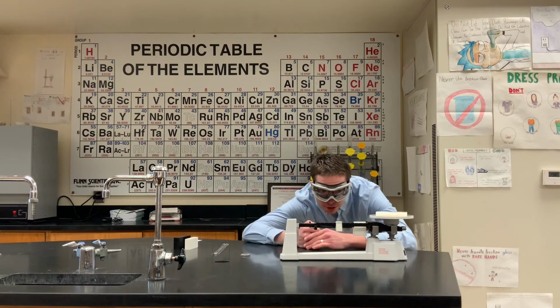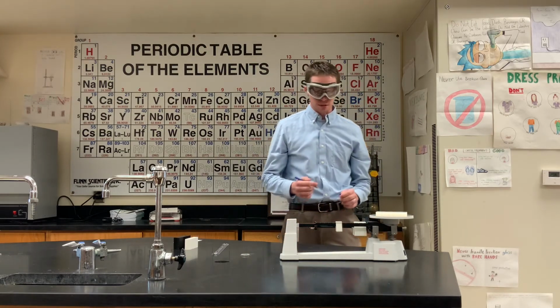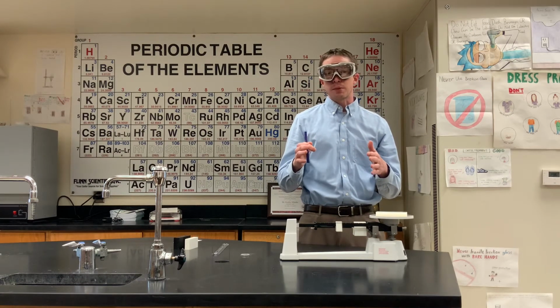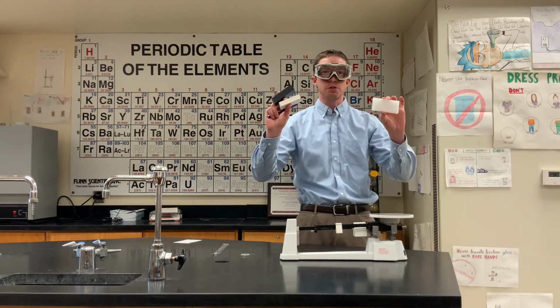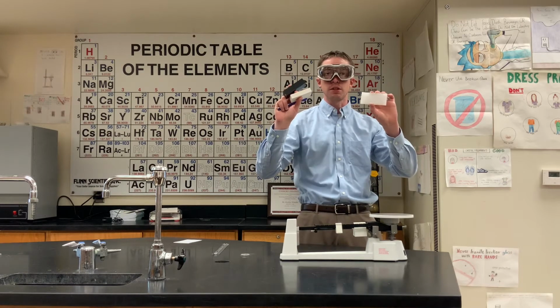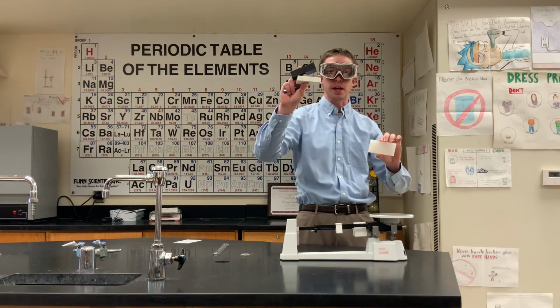And for the mass, it looks like we are at 61.98, Mr. Wheeler. 61.98 grams. And we will, in the lab sheet, have a number of different types of plastic for you to choose from. So even though there are 3 types of plastic that you are going to get measurements on, we will have more than 3. And using the density, which is one of the intensive physical properties of the substance, you are going to determine what types of plastic the cloudy, the white, and the black plastic are.